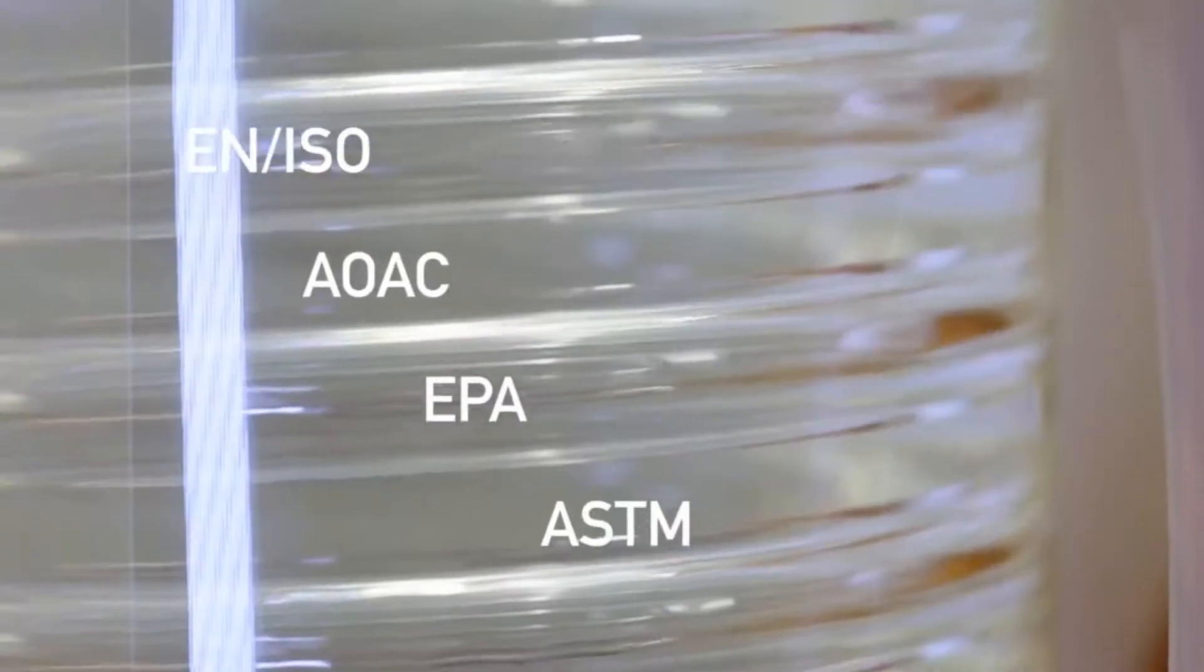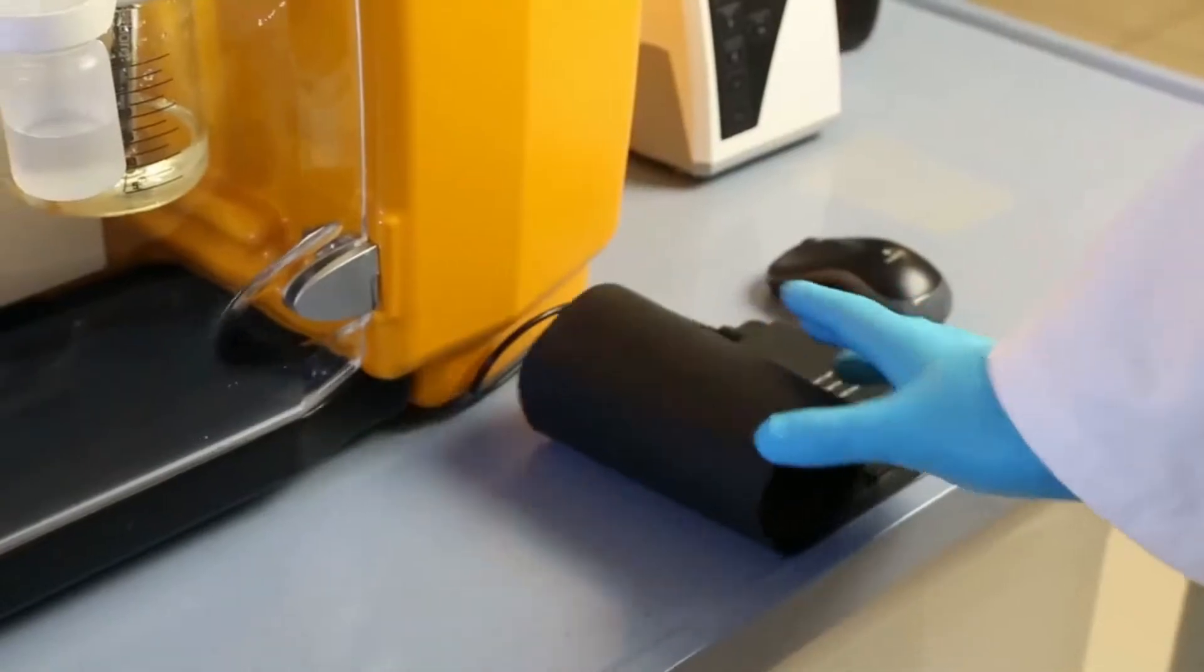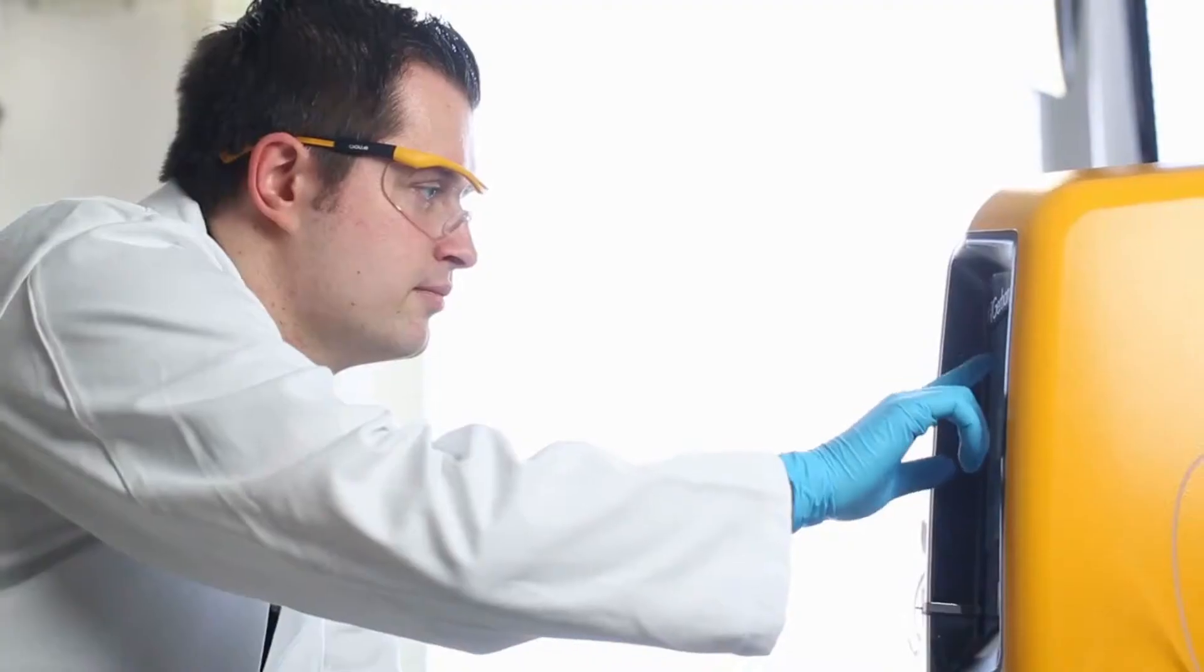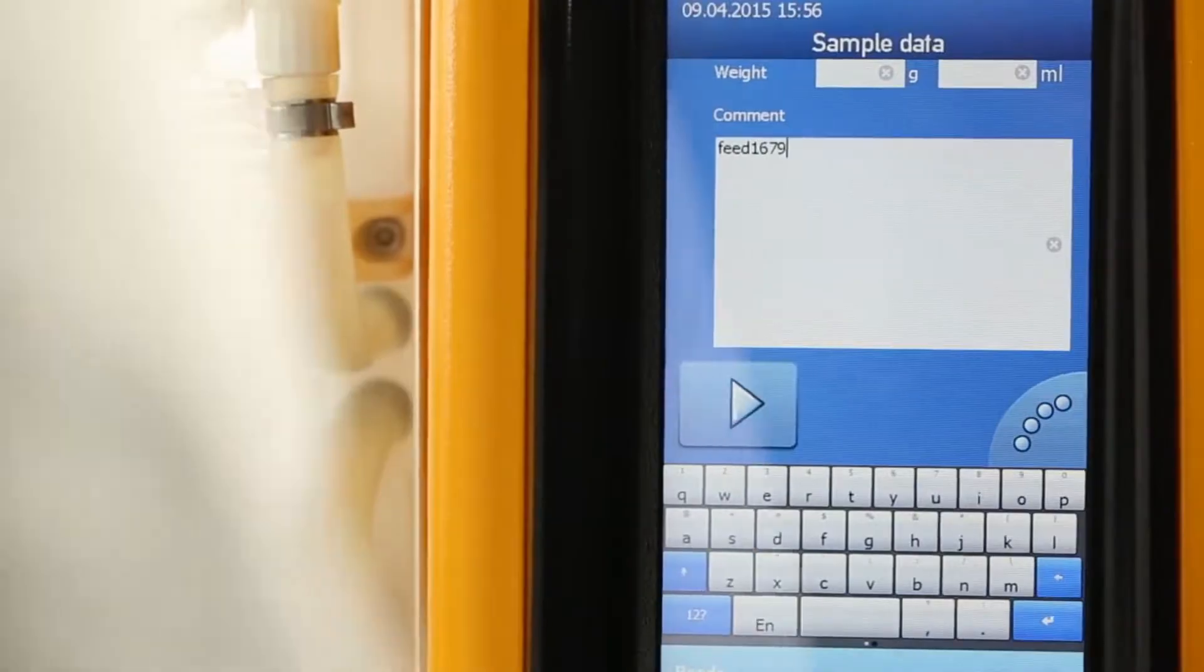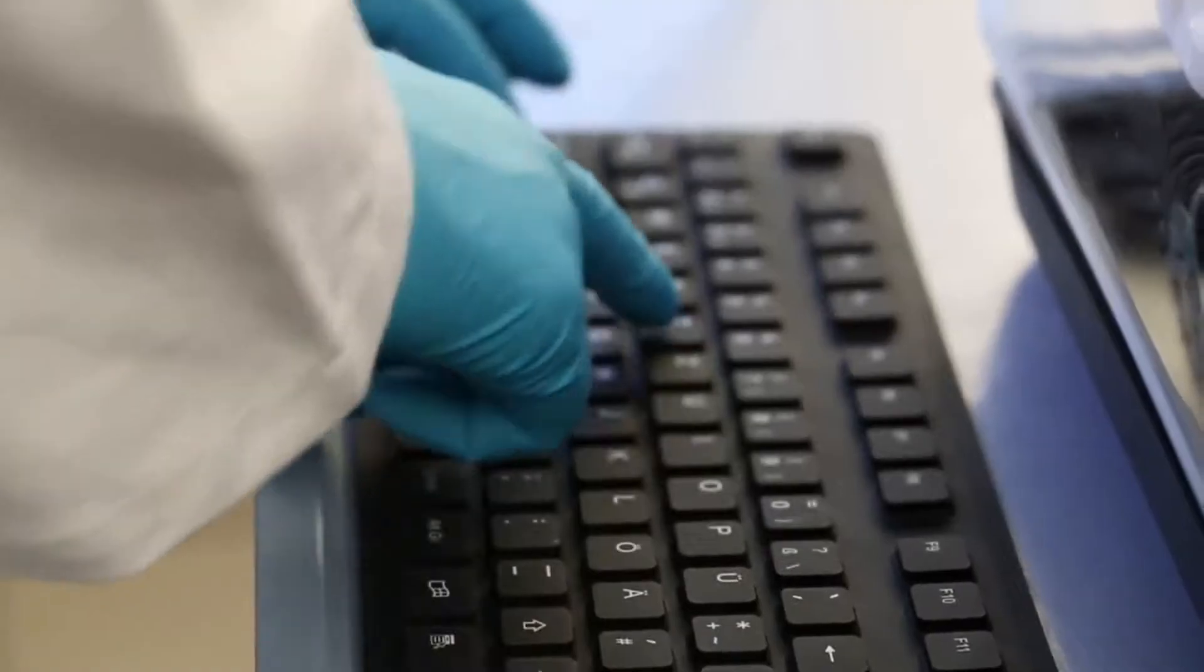The analysis results exceed the requirements of official international standards. Extremely convenient to use via the new 7-inch color touchscreen or via keyboard and mouse.